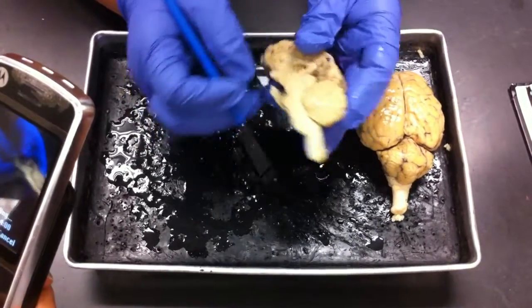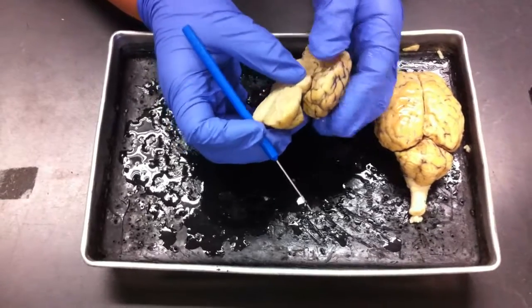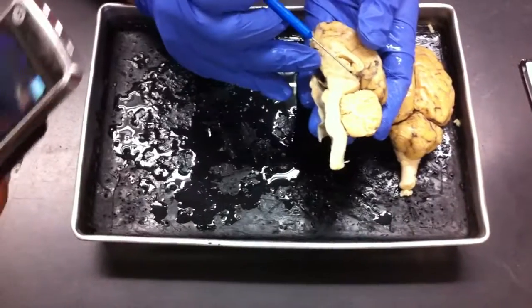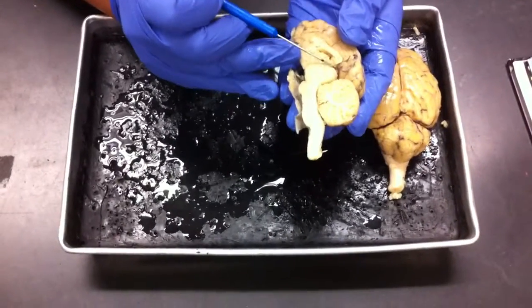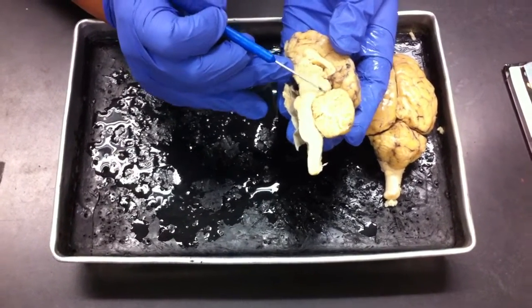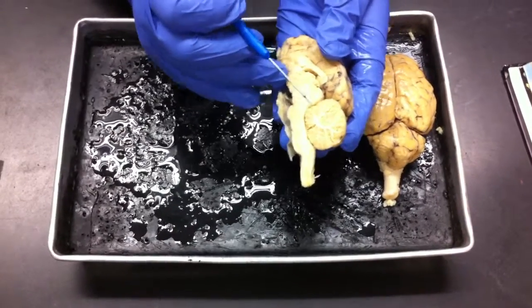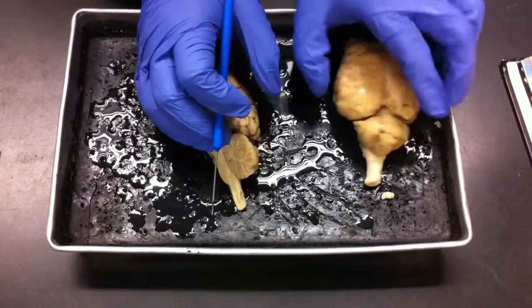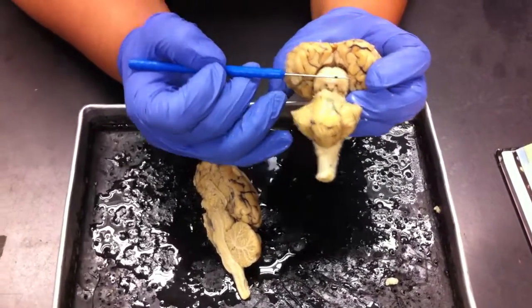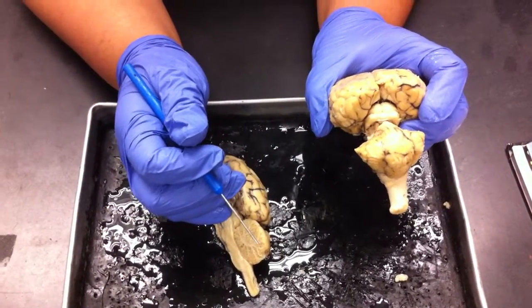Okay, the other one we had in earlier was better. In this area here, we would have the pineal gland, and then the superior and inferior colliculi. In half of the brain they are referred to that way, but if you have the whole brain and it's the four of them put together, looking at the superior and then the inferior underlying, that would be the corpora quadrigemina. Any questions or any specific ones you need?